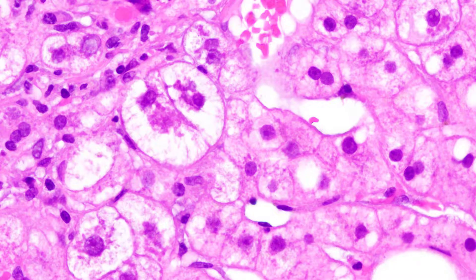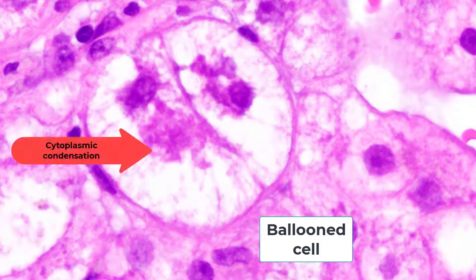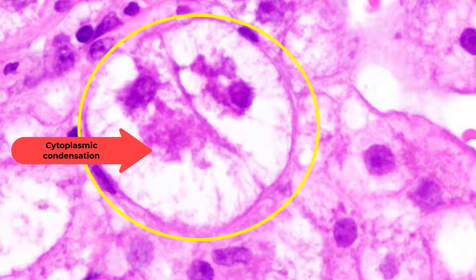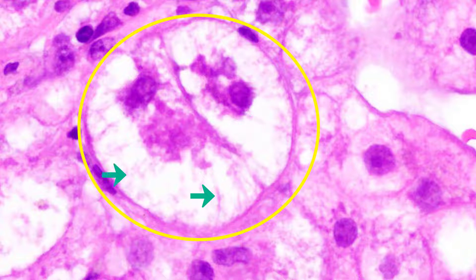Here's another balloon cell. It's clearly enlarged and has that cytoplasmic condensation around the nucleus. But many of these balloon cells also have spider-like processes extending from that condensation to the cytoplasmic membrane. A classic balloon cell, ladies and gentlemen — very, very classic.